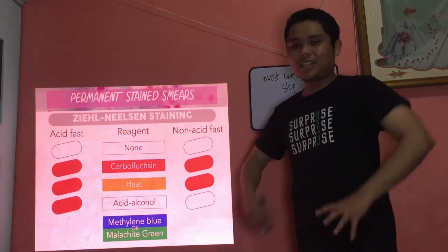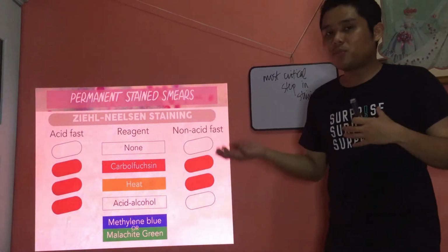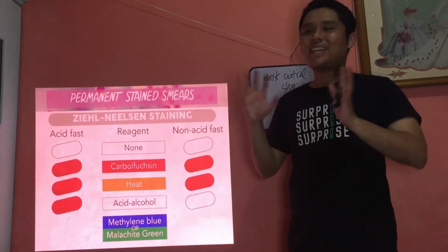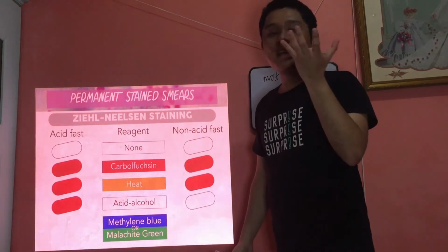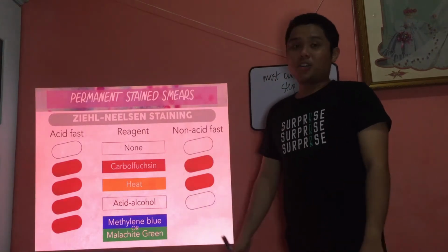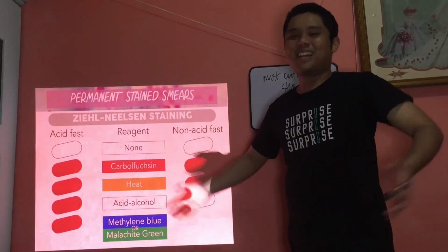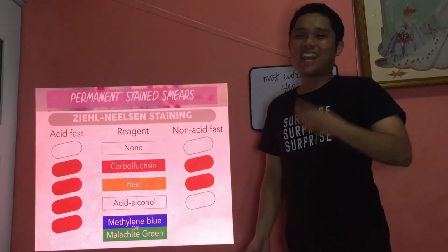So for acid fast, since the relationship between carbofuchsin and the organism is really strong, loyal na sila to each other, they don't want any other else, diba? So pag-add sa imong secondary stain, of course, they will not take it up, the organism will not take it up, and it will remain color red. Whereas for the non-acid fast, colorless man siya, brand new, yes, clean slate, ready to mingle, single, ready to mingle, yes, ready pa siya to accept a secondary stain.